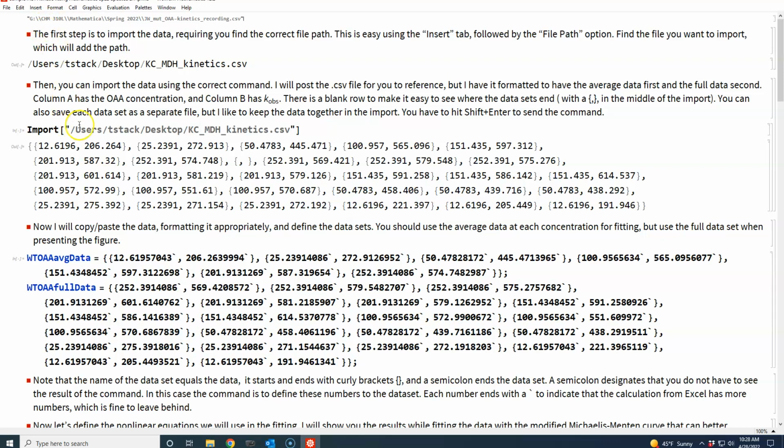So is it the right thing to take this and paste it over the old file where it says import? I think so. That's easiest. Okay, so I'm going to paste everything, including the quotation marks. So I'm going to do copy and then in here, and it even lights up green, and then paste. So now I have imported the new data. So the old data is still there.